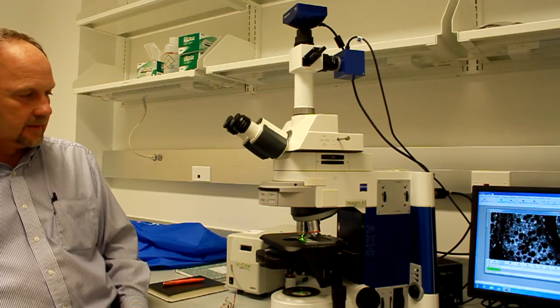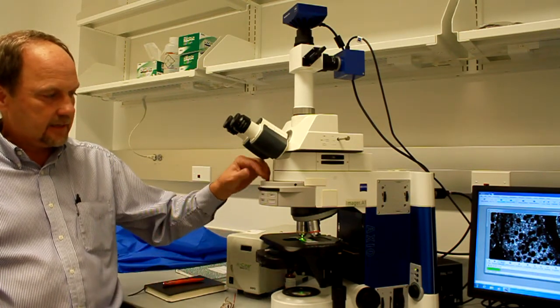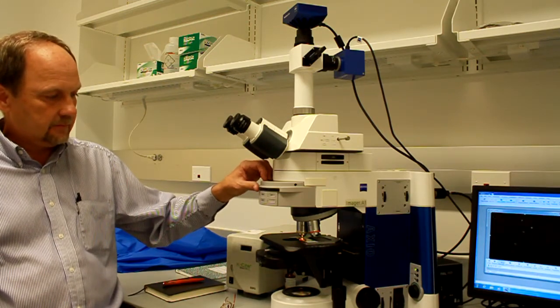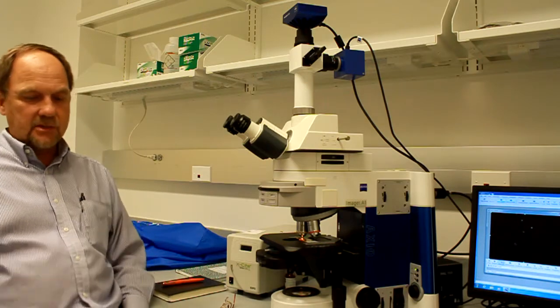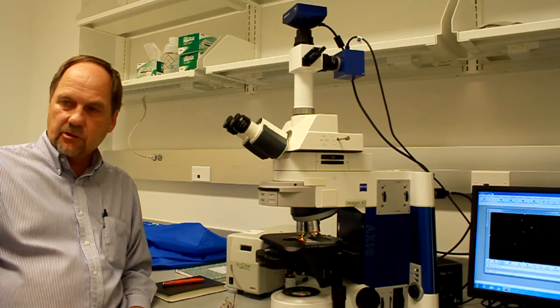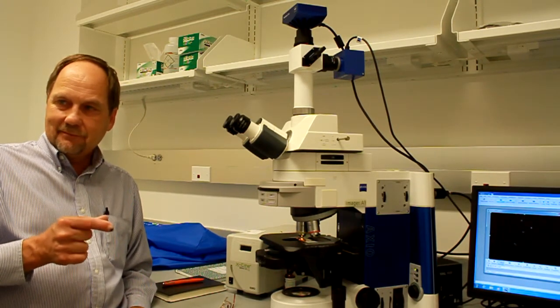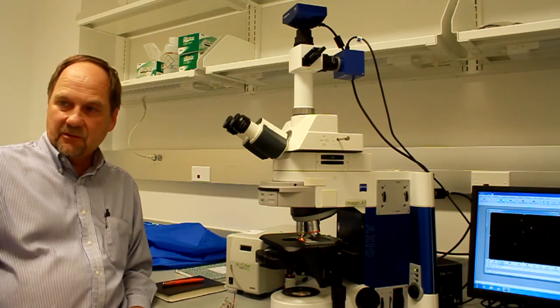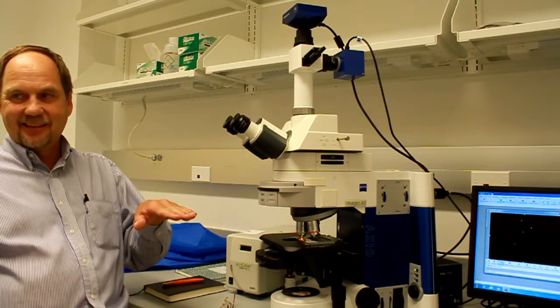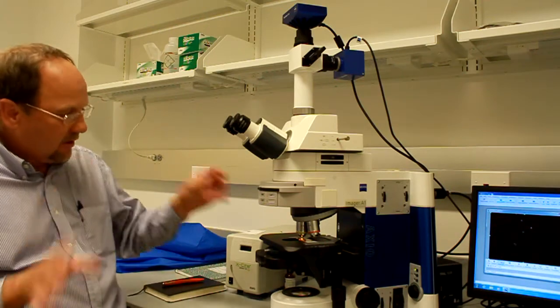Fluorescence is sort of a simple technique in that you just change your filter set. So all the science is in the probe and in the filter sets that you have. So Colleen is just trying to get a different one for the red. There's really about 3 or 4 different wavelengths in red. So let's say the excitation and emission, and how much they overlap. All that stuff.